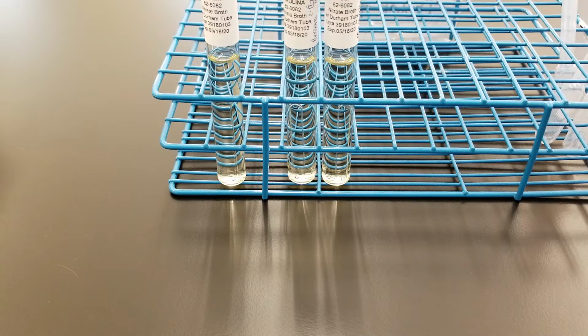So usually if you see other species of Neisseria other than lactamica and meningitidis and gonorrhea, or other species of Moraxella other than catarrhalis, then you're expecting that that would be a contaminant.